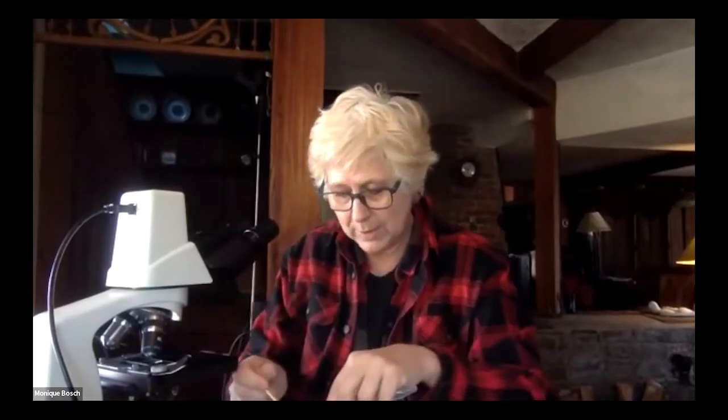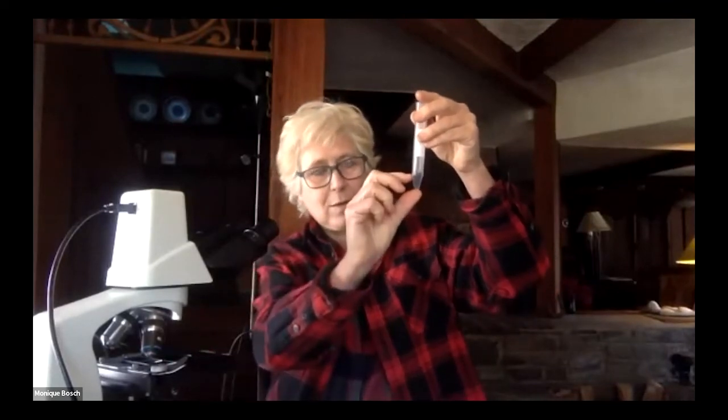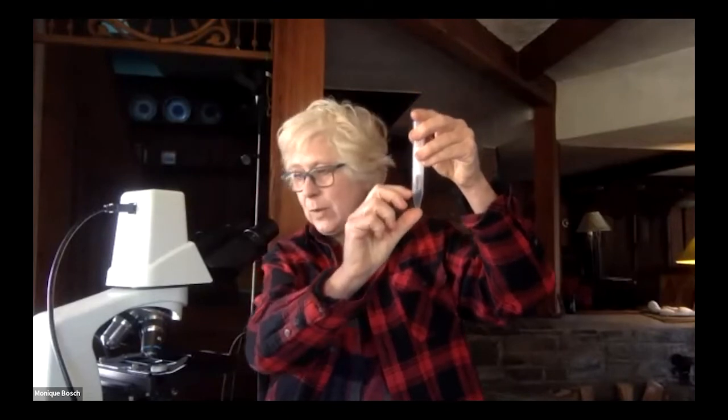So you take a test tube. I have some compost here. So I'm just going to fill up what we call 1 gram. So if I was doing this around soil, I would go around the roots of the soil. So remember, this is compost and it's not necessarily interacting with soil and it's been sitting around. So I'm not sure what we'll get, but let's just check it out. I'm more interested in showing you how to make a slide. So you've got where it changes shape, that's 1 gram.